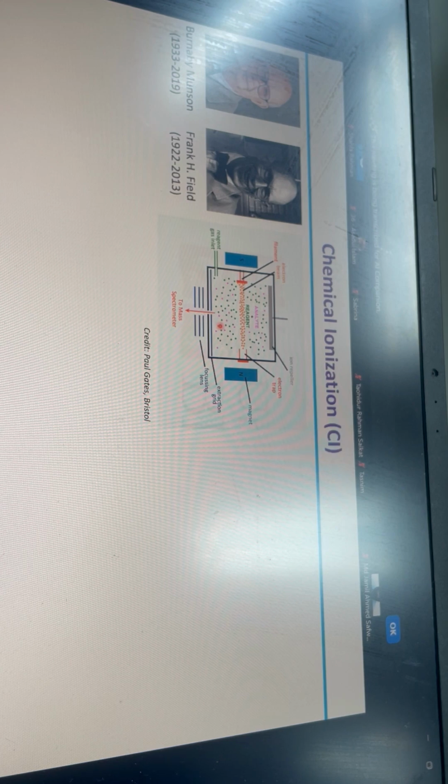Same thing with the previous electron ionization technique: you have electrons and then you have analytes. When they directly interact, they fight, and the analyte breaks down. So they introduced some kind of reagent gas, so that first the reagent gas interacts with the electron beam, and then that gas ionizes the analyte.